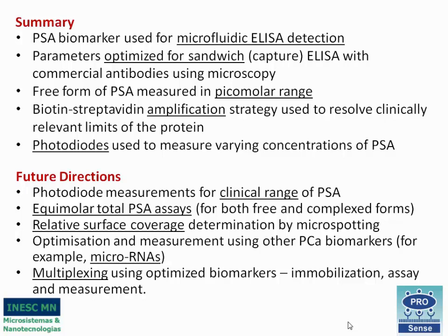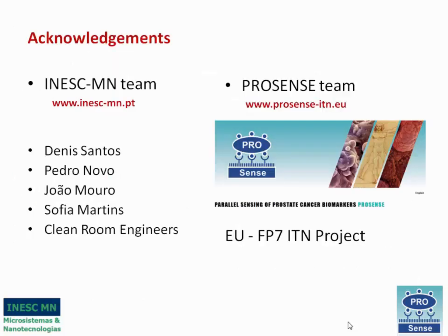So this would be performed by microspotting experiments, and then we would also simultaneously try other PCa biomarkers such as microRNAs to have a multiplexing where we can read different biomarkers in the same device that would enhance the reliability of the diagnostic device that we intend to develop.